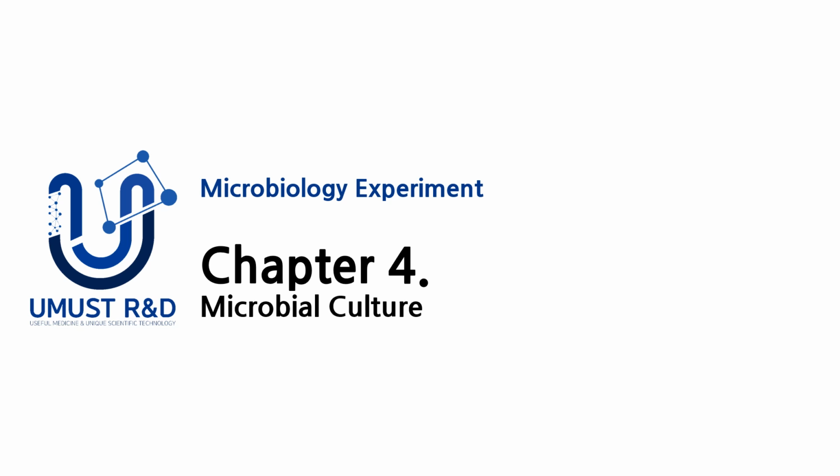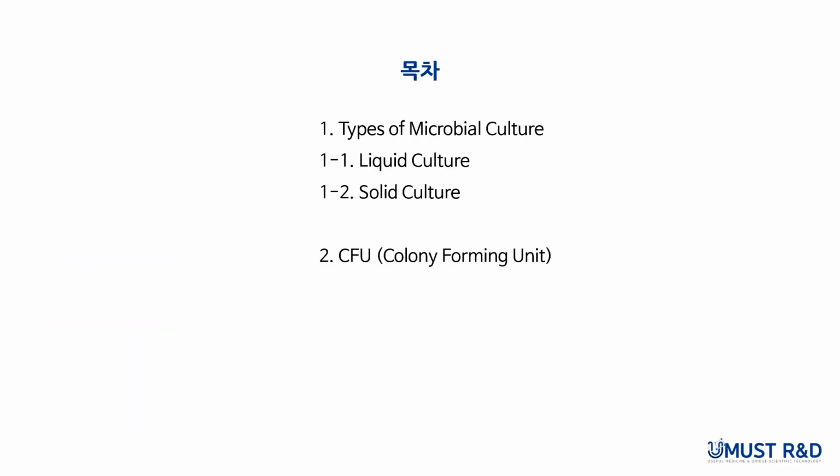In this lecture, we will build on what we have learned in the previous four sessions and learn how to actually culture microorganisms. Culturing microorganisms is an important technique in microbiology, and we can study their growth, characteristics, and metabolic activities. This is what we will cover today.